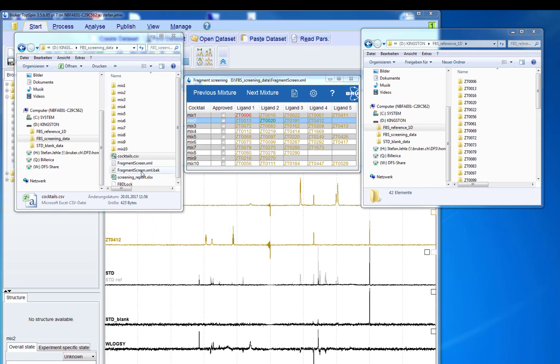For each mixture a dataset with the mixture name is measured in which all the screening data are saved.